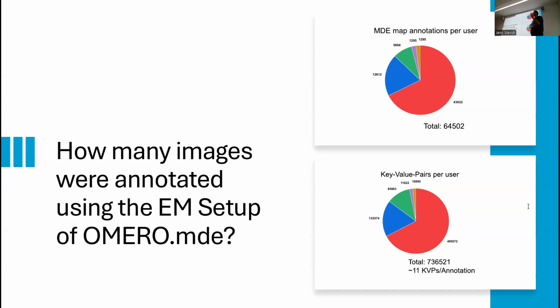This is because in our facility it's organized this way that electron microscopy is done as a service usually. So only my colleagues in the imaging facility are doing this on behalf of our users, and they upload all the data to OMERO. That's actually the charming thing about using electron microscopy to try this stuff, because it's my immediate colleagues doing this on behalf of our users. So it's 100+ users, I would say, affected by this, but done effectively by 5 annotators. I deleted 3 annotators who didn't contribute a lot.